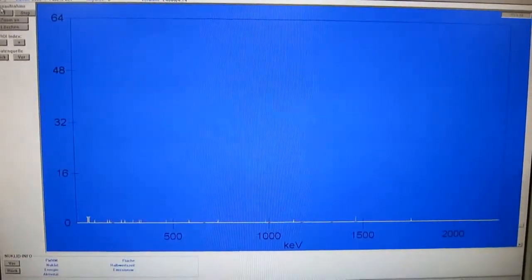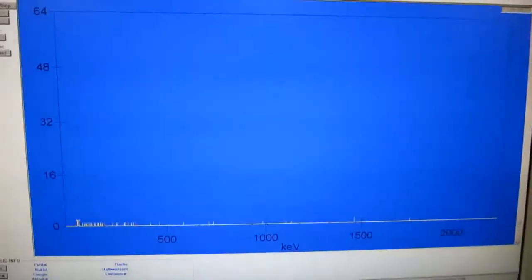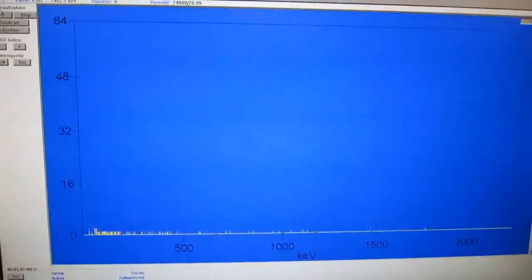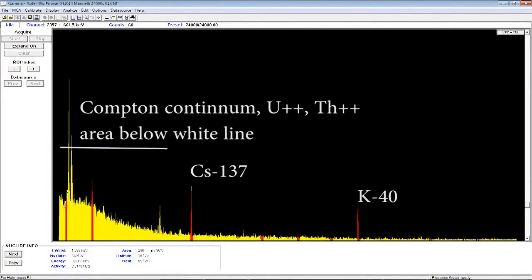This is the gamma spectrum of that apple sample, and you can see that we don't really see much as of yet. No significant cesium peaks or anything, but of course we're just measuring for a few seconds now. So let's take a look at that spectrum after 24 hours. This is the spectrum after 24 hours, but it also includes the background.